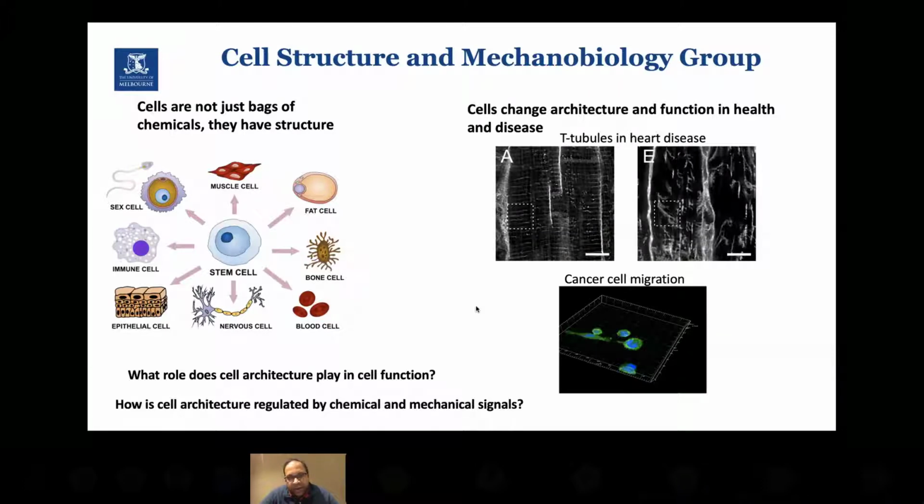A particular interest to us is to understand how cardiac cells that make up a beating heart, how their architecture changes in disease. We're interested in understanding, using computational models, the biophysical mechanisms that are involved in regulating that cell architecture, and again, how that architecture regulates cell function. So here's an image on the right here.